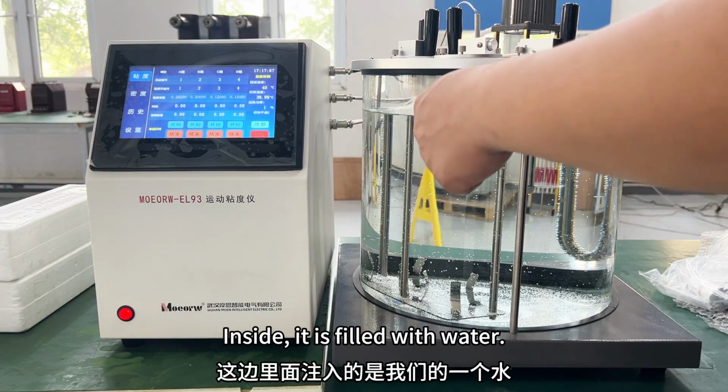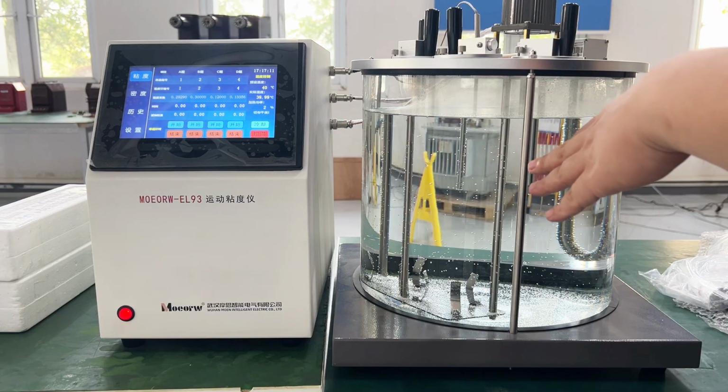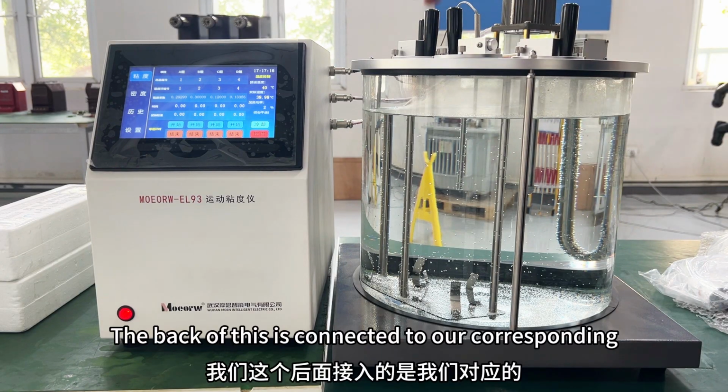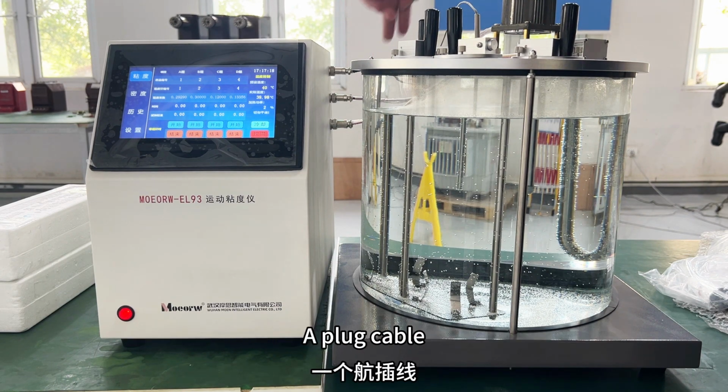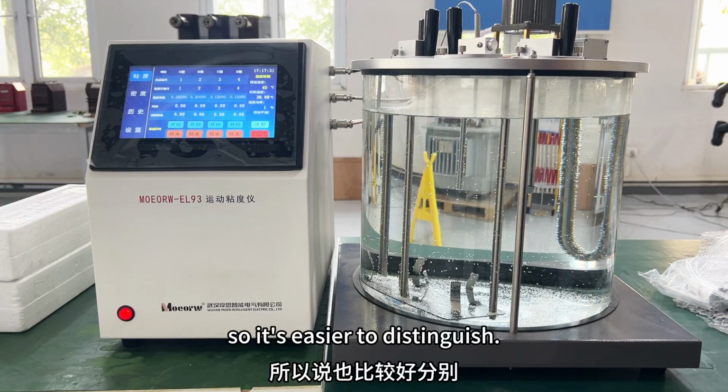Inside, it is filled with water if it's below zero. Only one of these can be injected: anhydrous ethanol or petroleum ether. The back of this is connected to our corresponding plug cable. Each plug of the plug-in line is different, so it's easier to distinguish.